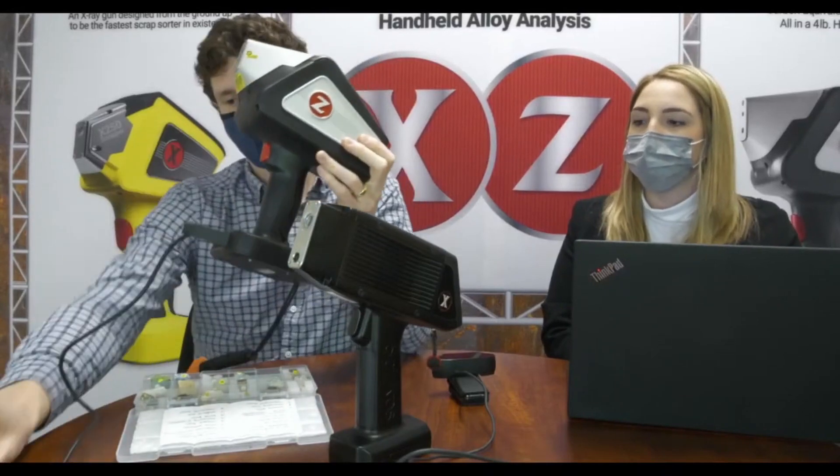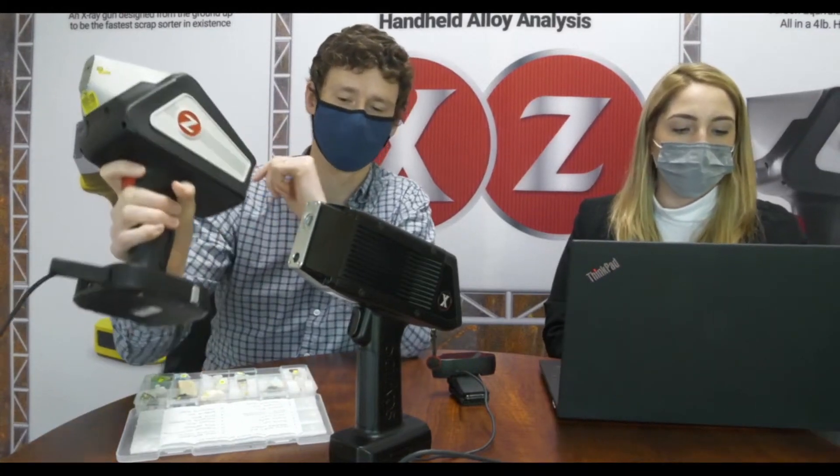First off, the Z300 uses Laser Induced Breakdown Spectroscopy, or LIBS for short. One of the best things about this technology is that you can see almost any element on the periodic table. Other handheld elemental analyzers like XRF have been limited by not being able to measure things lighter than magnesium, or lower atomic number than 12. The great thing about LIBS is that you can actually measure those elements lighter than magnesium.